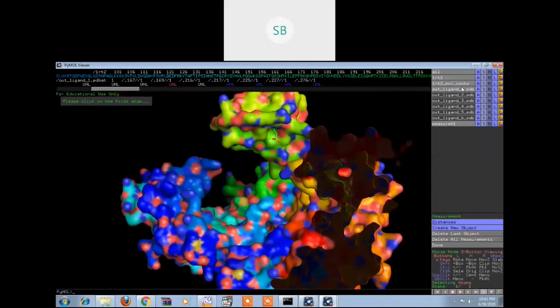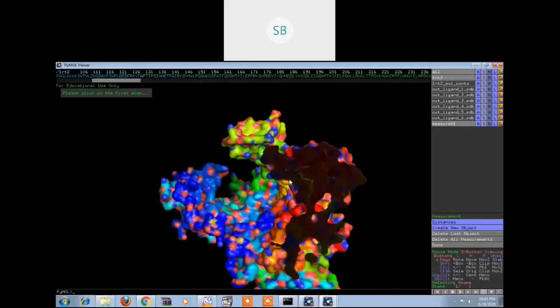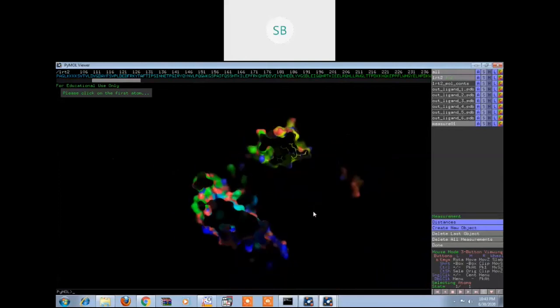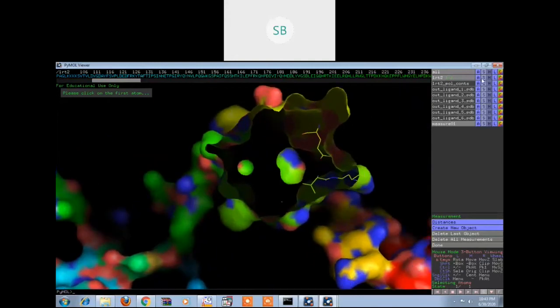So it's better, let me do one thing. It is somewhere near here.